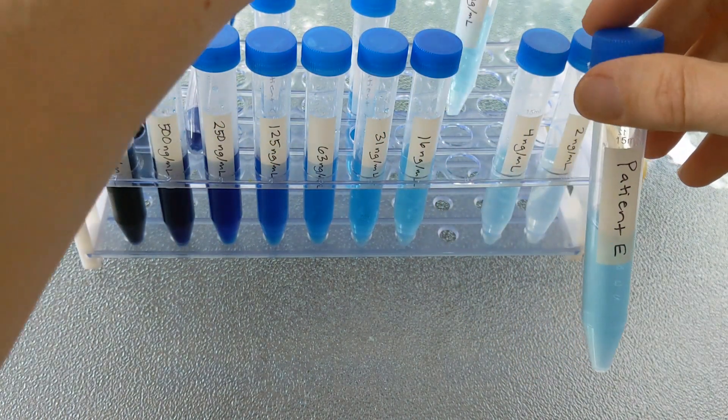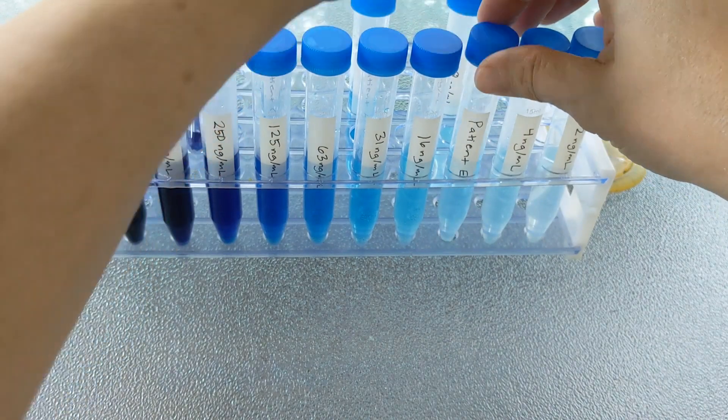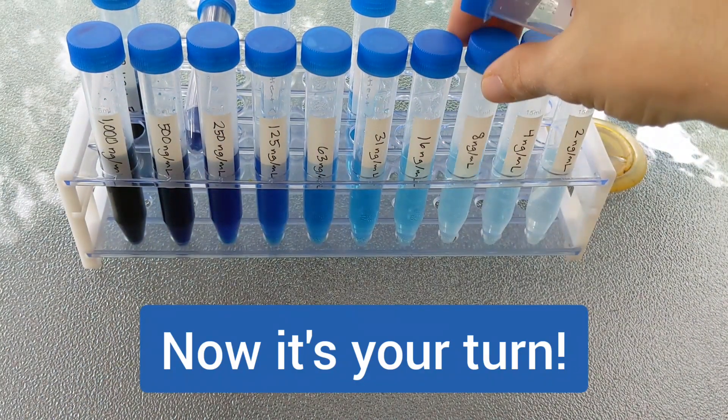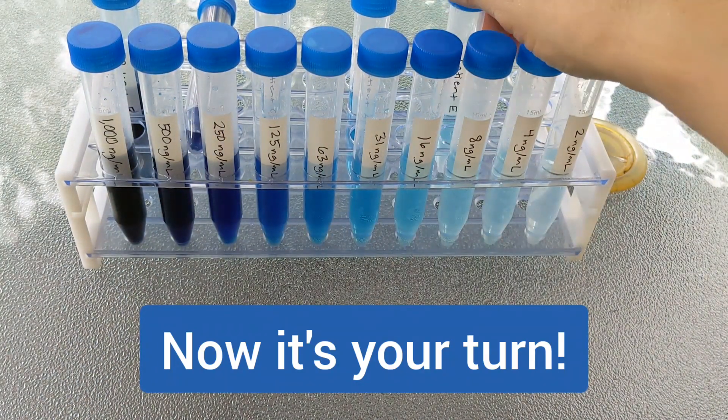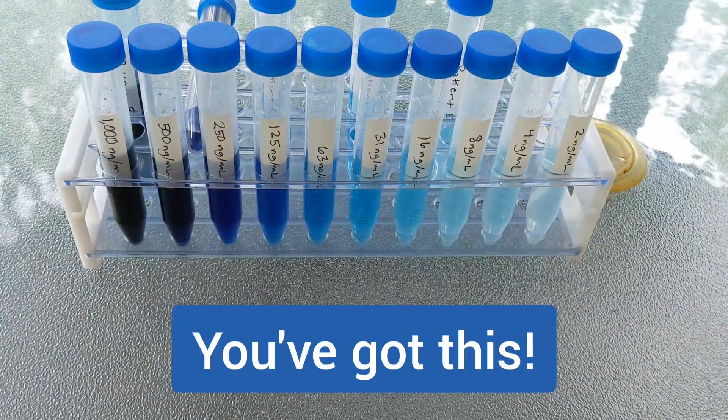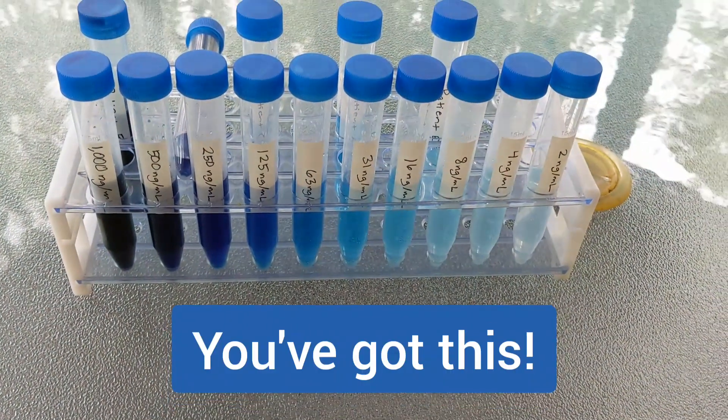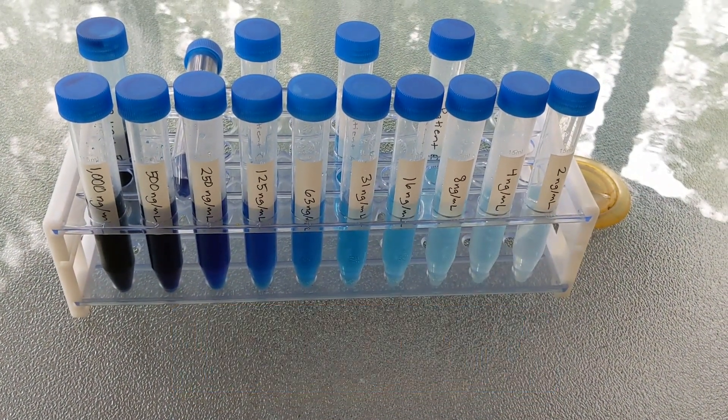So when you are checking your own results, you want to go for the best color match. And then just make sure that you have your serial dilutions correctly calculated. Make your comparison. And that's how you'll know the antigen level of your patients.